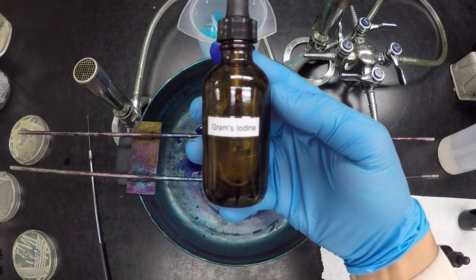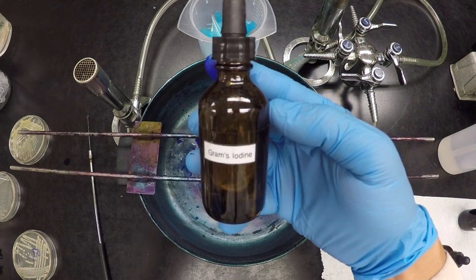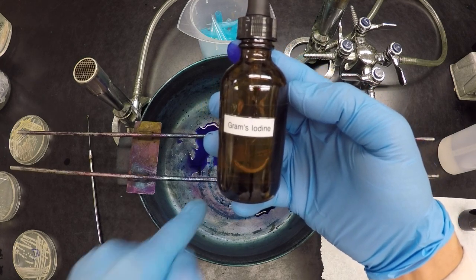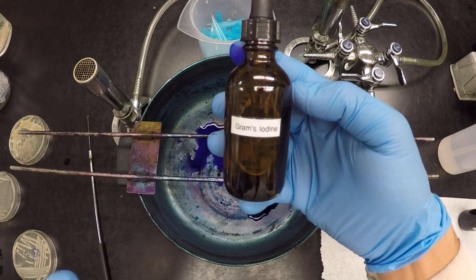Gram's iodine is our mordant, and what the mordant does is it's a fixative. It's going to fix the color to the cells, right? Now, sometimes people get confused and they think a fixative fixes the cells to the slide. That's not what's going to happen, right? Because we know it's the heat fixing that fixes the cells to the slide.